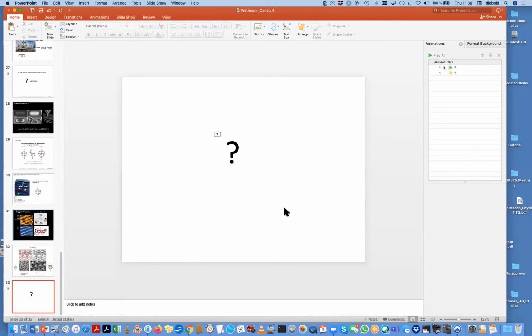So many years ago, there seemed to be a very useful method called atom tracking, where the tip was sitting on or stuck to an atom by a feedback, and then following it, out of that you might evaluate, for instance, I don't know, activation energy, or a similar parameter. Would it be useful in your case, or is that method more or less forgotten and not used?